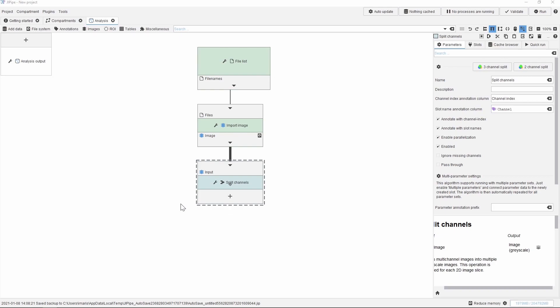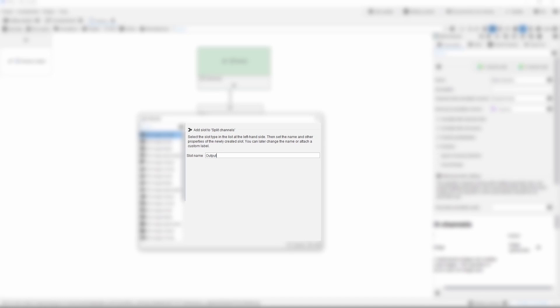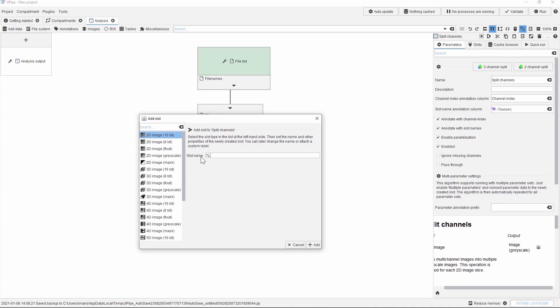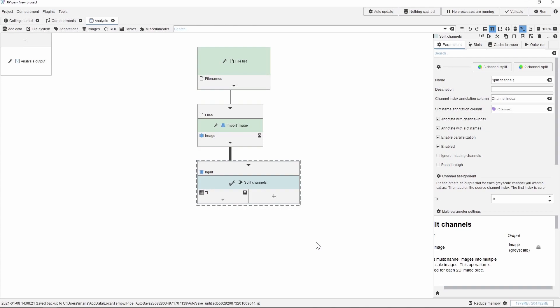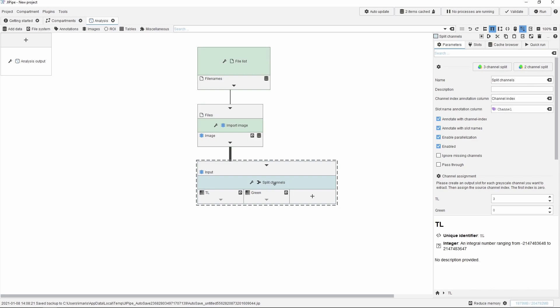For the sake of flexibility, the channel splitter node allows us to fully customize which channels are extracted. By default it comes without any outputs. In order to add the new output, we click on the plus sign. This opens a new window where you can choose the data type and a name for the new output. For the first channel we will choose the name transmitted light TL and then we click on the Add button. We then repeat the same steps for the green channel and specify which input channel belongs to each output slot.